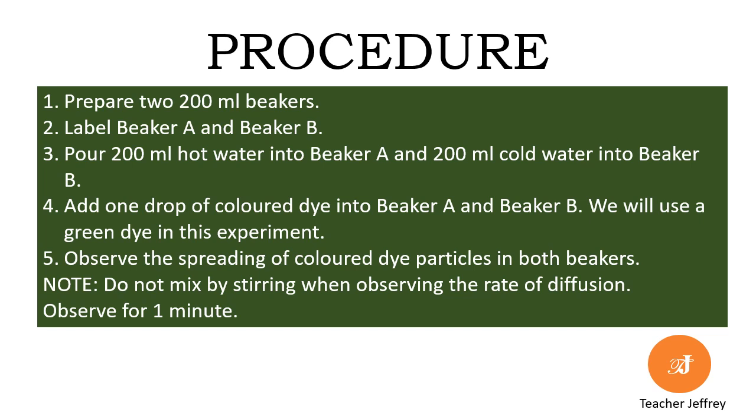5. Observe the spreading of colored dye particles in both beakers. We will time it within 1 minute. Take note, do not mix by stirring when observing the rate of diffusion.